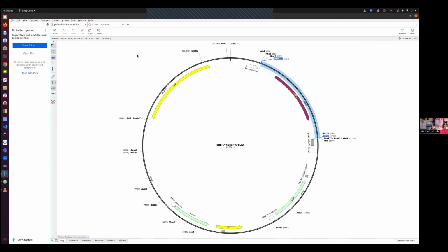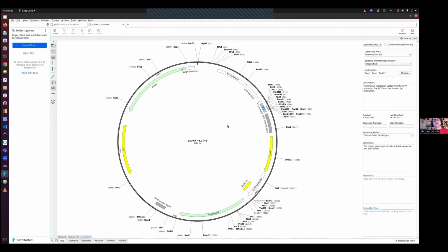Both of them are very commonly used enzymes. So I select HindIII and then I push down the shift button and I select NotI. So now I have selected here the fragment, which is excised by using these 2 enzymes. And then I go to the acceptor or to the target vector, and I choose exactly the same enzymes, HindIII and NotI.